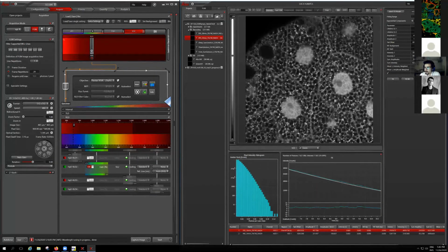So Powell is asking, the chi-square is not that good even with a clean sample. What is the general advice? How to deal with the bad chi-square values, and what do they say?